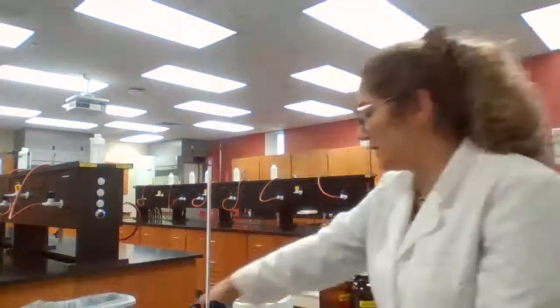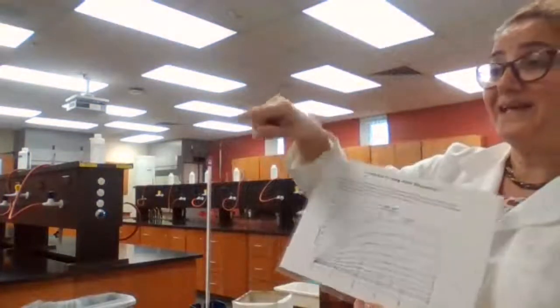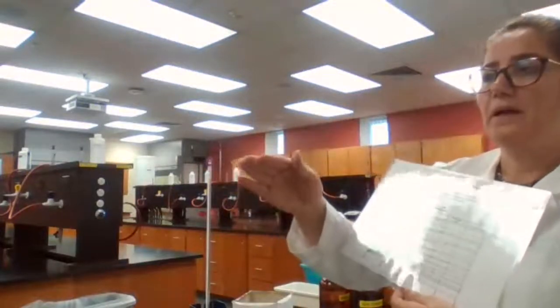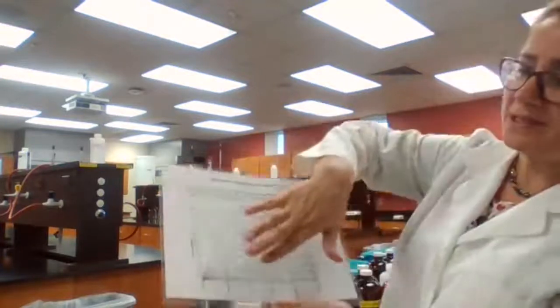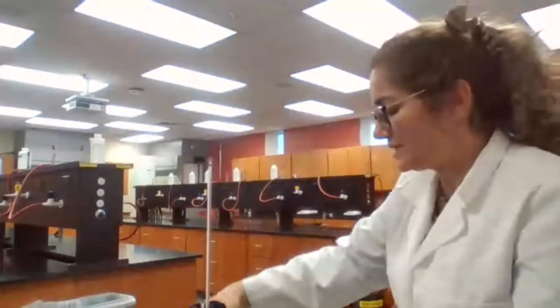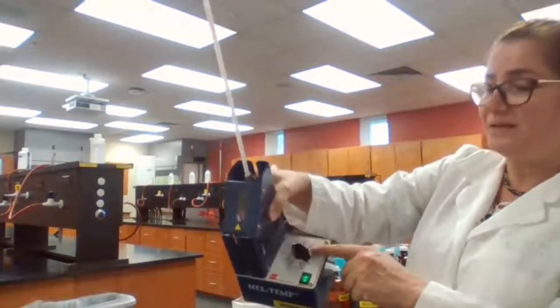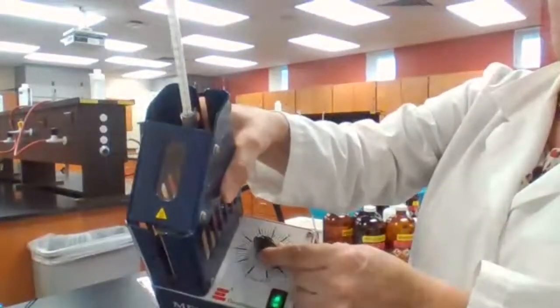The experiment range is not 50 to 100. That's just for setting of the 80 degree, which is the actual melting point for naphthalene. We already know that naphthalene should melt around 80. So based on this chart, if my compound melts anywhere between 50 and 100, I'm going to set up the power regulator, which shows here, at 3.